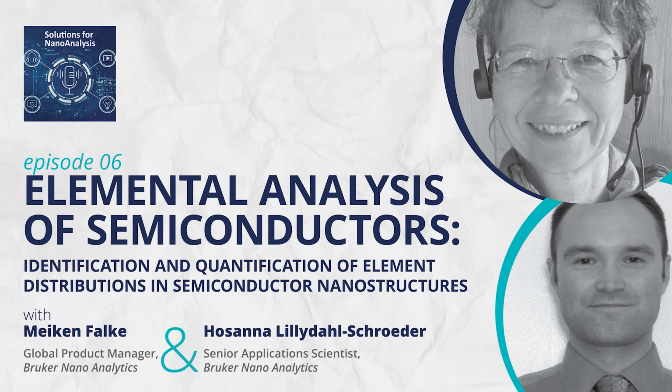One is electron beam damage. So more and more, I also see the requirement from semiconductor manufacturers to avoid beam damage and measure fast. So there we need large detectors. And being fast, having large detectors or large collection angle detectors, this invites for temporal resolution, which means in situ microscopy.